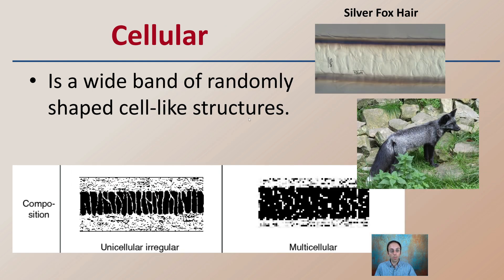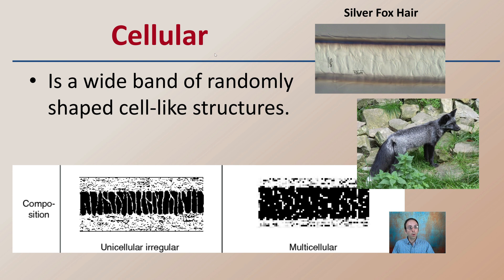The cellular medulla shows a wide band of randomly shaped cell-like structures. The silver fox is an example of this medulla pattern, and each scale bar here represents 10 micrometers.